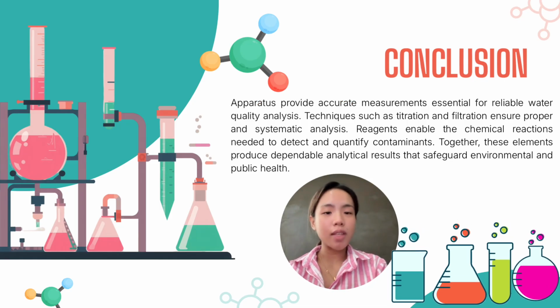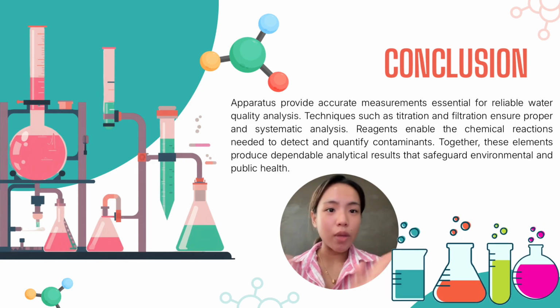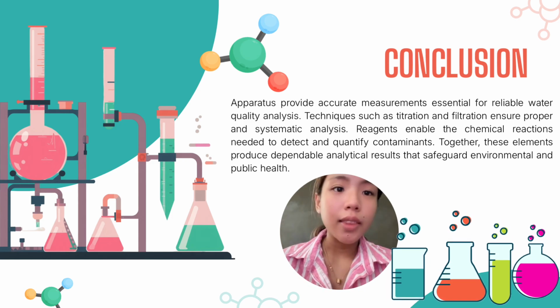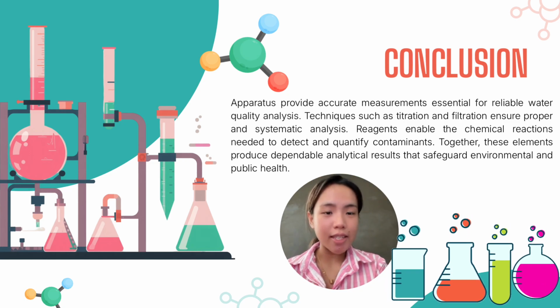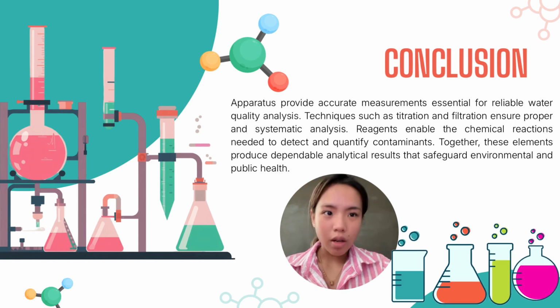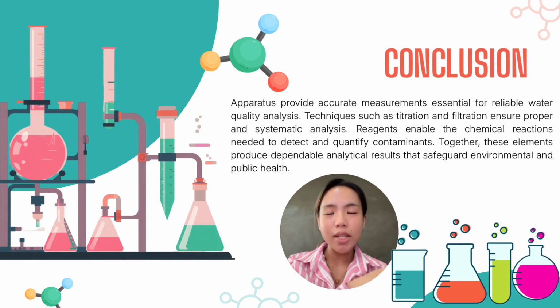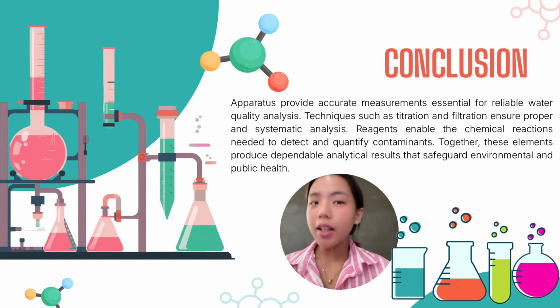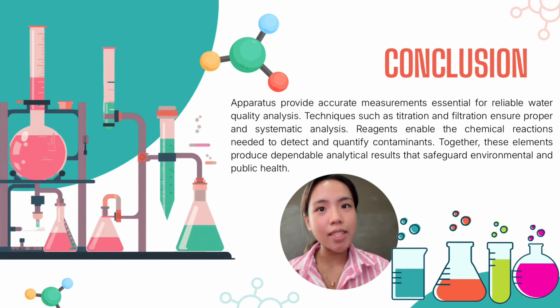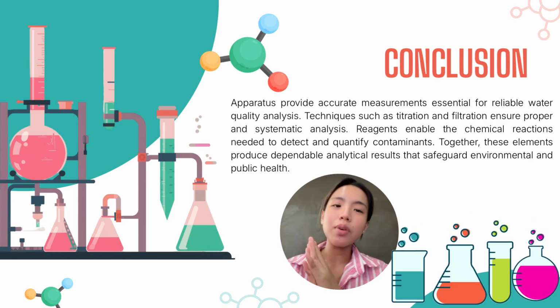Finally, this brings us to our conclusion. Apparatus gives us the accurate measurements we need for reliable data. Techniques such as titration and filtration were used here to ensure our analysis is systematic and reproducible. Reagents drive the essential chemical reactions that allow us to detect and quantify these otherwise invisible minerals and contaminants. Ultimately, it is the combination of these elements that produces dependable analytical results, giving us the power to safeguard both environmental and public health.